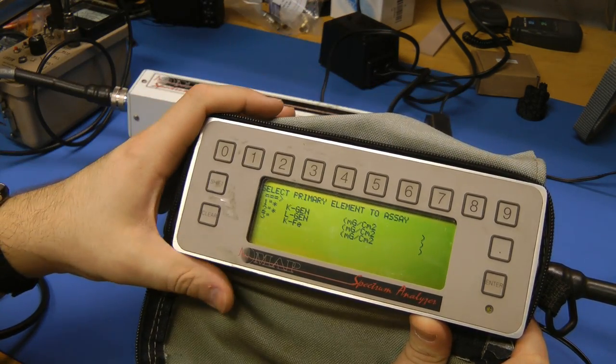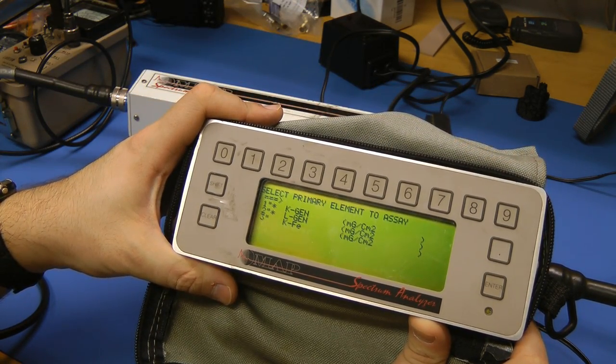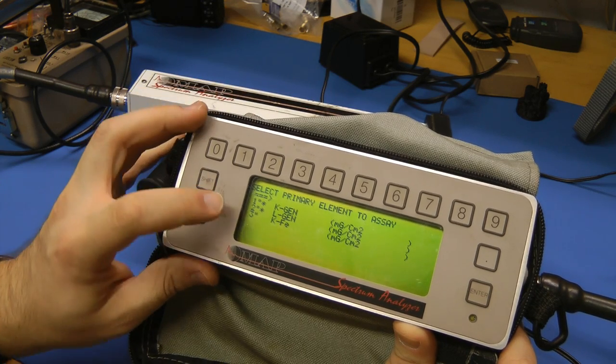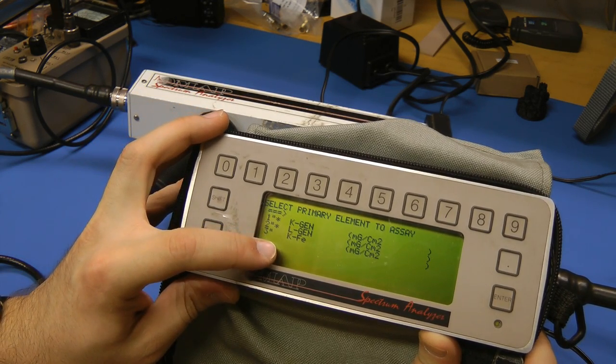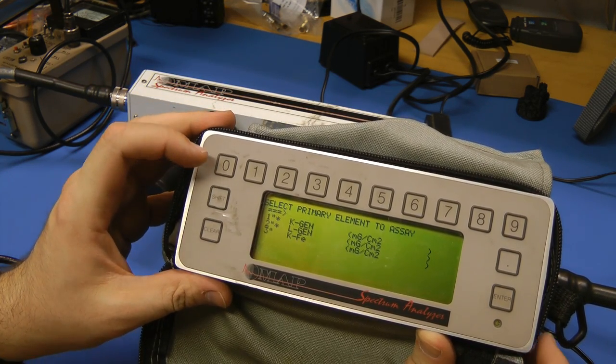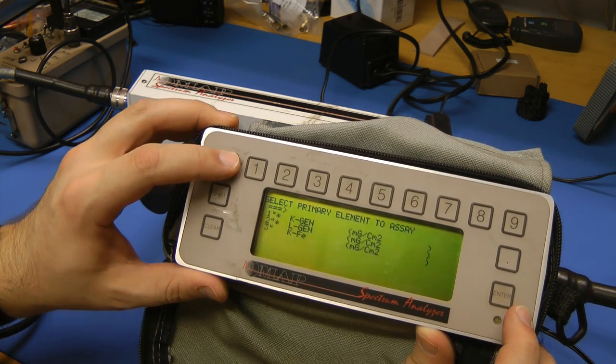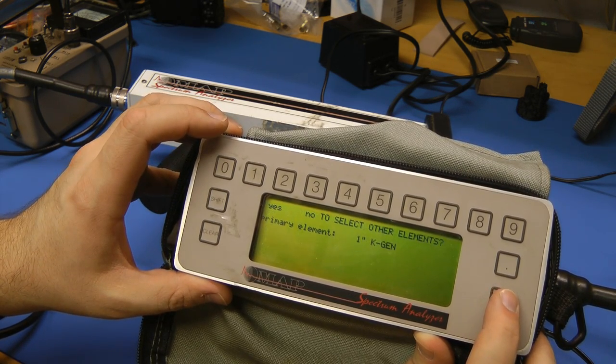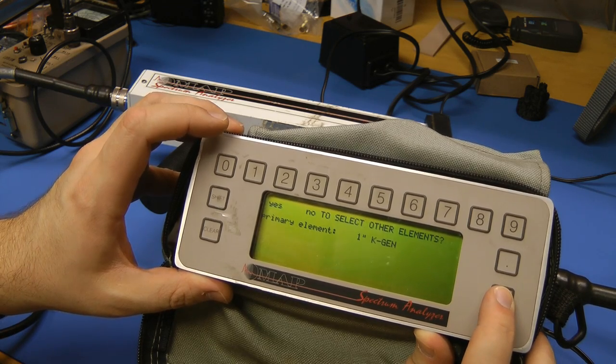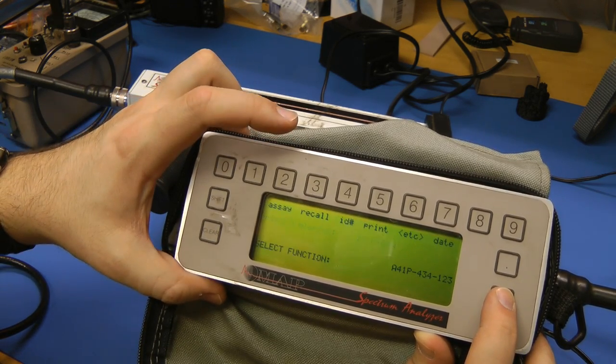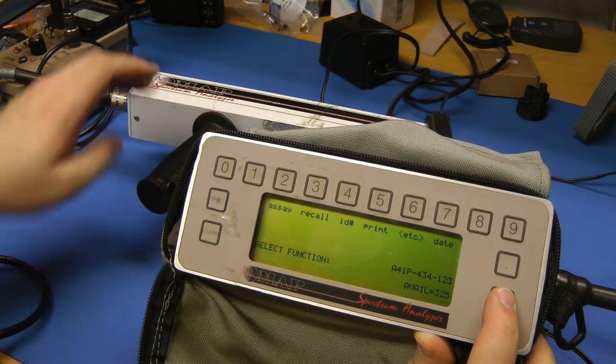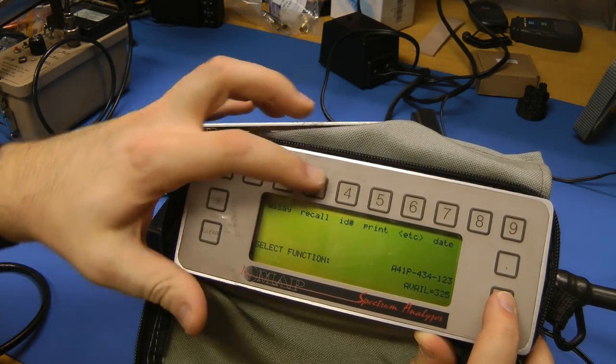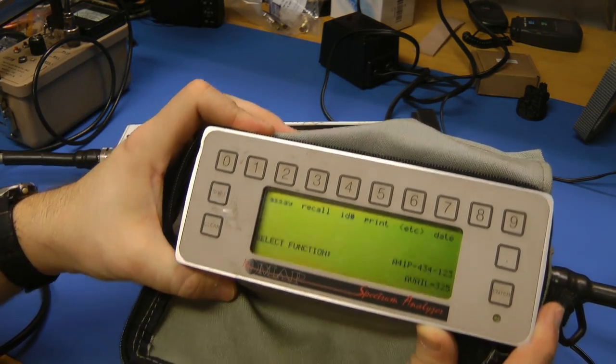Select primary element to assay. Kgen, Lgen, Kiron. Enter. Yeah, I'm expecting this is not going to do anything. Let's just get right to the teardown.